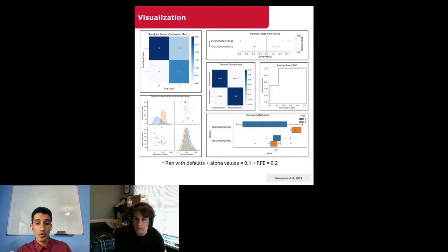And lastly, at the bottom, we have this distribution plot, which here is a box plot that gives us useful information about the distribution of features, as well as information about specific outliers and things like this. So overall, each of these plots provides the user with some additional information that they can use to interpret the results and understand their underlying data set. They can determine information about the efficacy of specific models, and it can also help them guide further downstream analytic decisions.